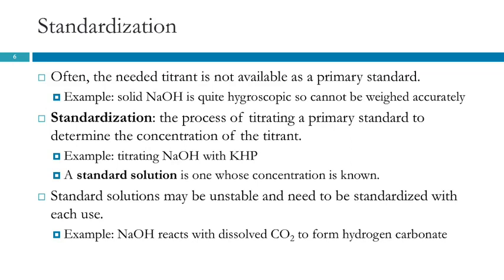So standard solutions like sodium hydroxide may be unstable, and they will need to be standardized with each use. That's true of the potassium permanganate as well that we did some redox with. Do you remember the lab practical in Chem 1A with that beautiful purple stuff? We can make that and we can standardize it, but over time, its concentration will change. So you standardize it and then you use it.